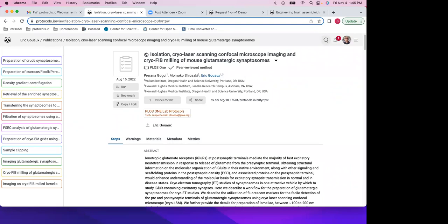I see. May I have one more suggestion? Because you have the button "work for me" on every protocol, the researcher can click on it, so all the people will know that this protocol should work. And should you also create another button to say that it doesn't work?